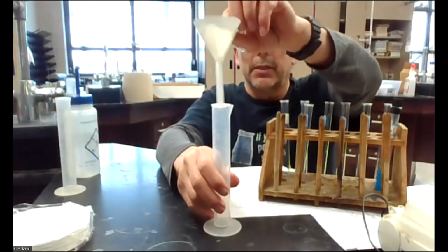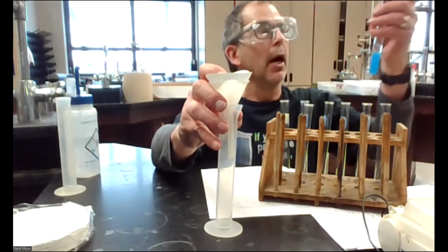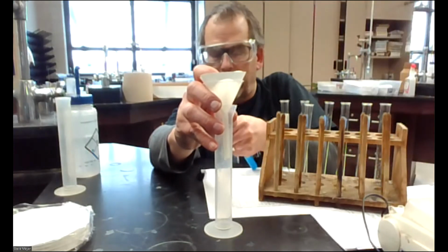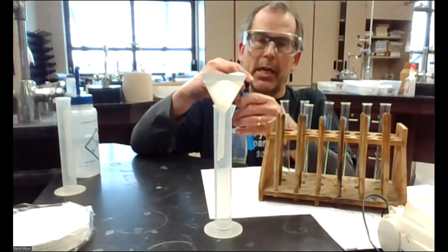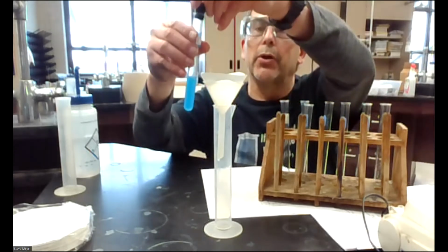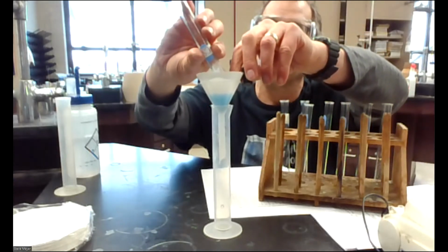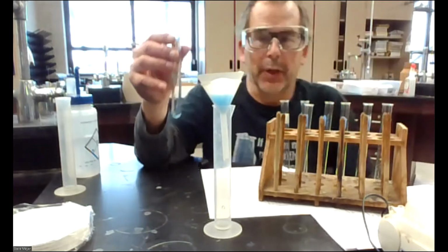I'm going to get a grad cylinder. And what I want to do is get all the solid into this container here. Now I might have to scrape or do things. I think this will come clean pretty well. And I might even give this another mix again before I do this. And then I'm going to do a quick dump in here. I don't want to exceed the capacity of this, so I'm going to be careful. That's fine. This came out almost perfectly.